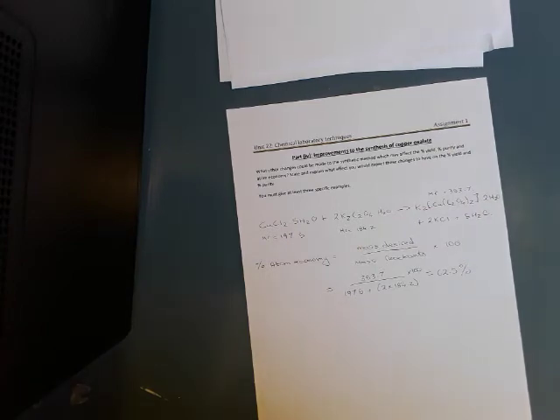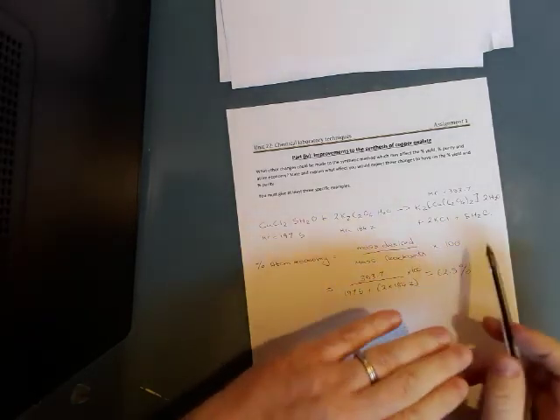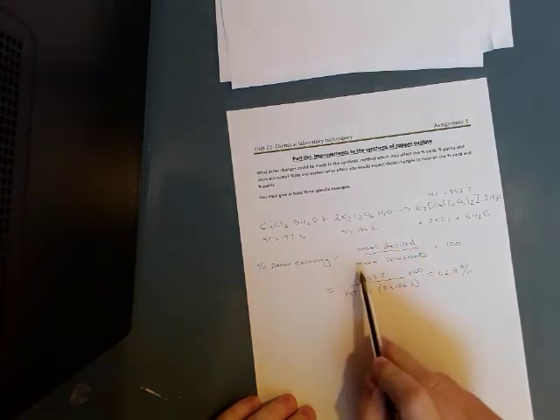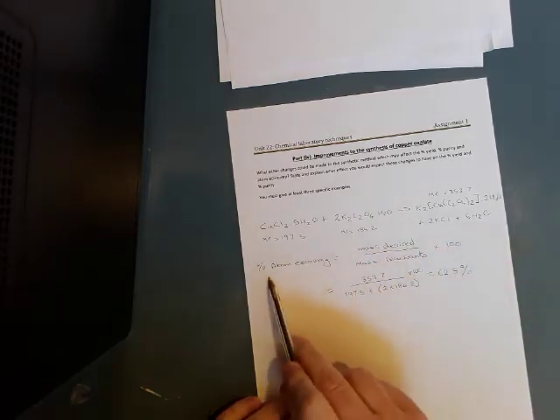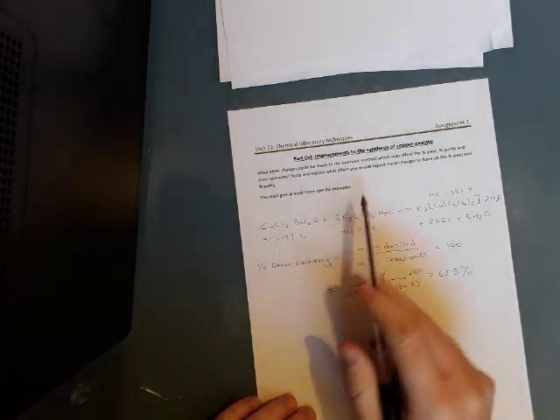And then lastly, when we're looking at improvements. I was talking about ways that can affect percentage yield earlier when I talked about the method. Ways of looking at percentage purity. Again, might be to do with the way that we're washing it. Using cold water. So we can filter it more. We could do more ethanol washing to improve it. But improving atom economy, the only way we can improve atom economy is as we talked about with the aspirin synthesis. We'd have to look at a different synthetic route. It's not one that you're going to do. But again, we could look at another way. And if we think about atom economy is mass of desired product. Well we can't change that because we want to make copper oxalate. Divided by the mass of the reactants. So this is the section that we would change. So if we're wanting this to be a bigger number, this side needs to be smaller.